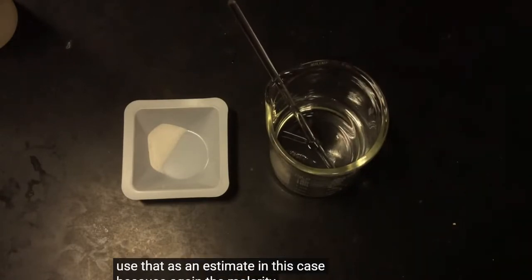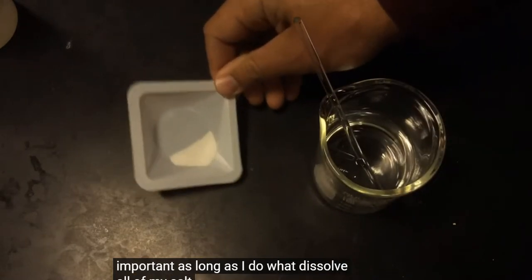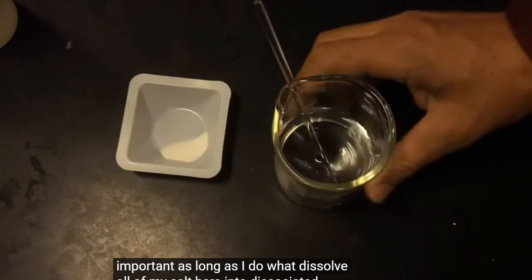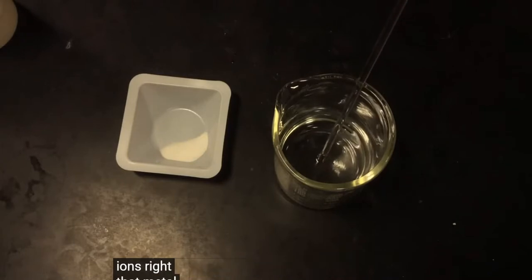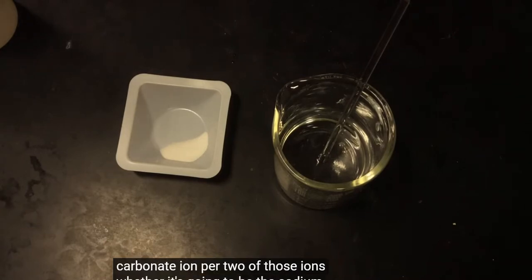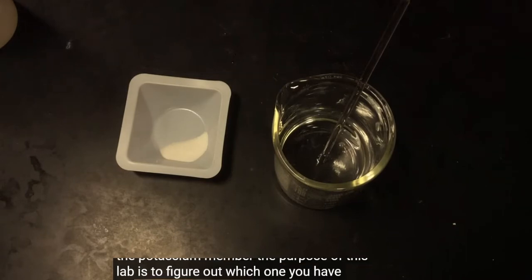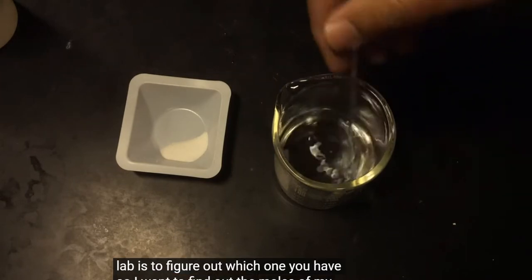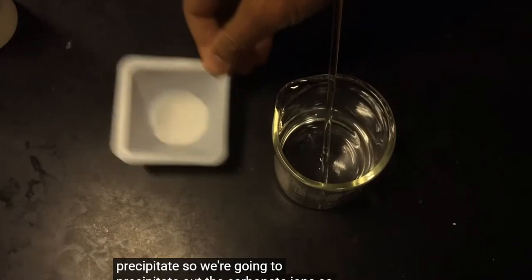What volume I use is not important as long as I do what? Dissolve all of my salt here into dissociated ions. Specifically, I want those carbonate ions. That metal carbonate has one carbonate ion per two of those ions, whether it's going to be the sodium or the potassium. Remember, the purpose of this lab is to figure out which one you have, so I want to find out the moles of my precipitate, so we're going to precipitate out the carbonate ions. So we've got to make sure that all of the carbonate ions are dissociated.